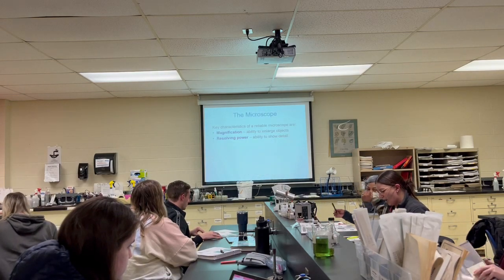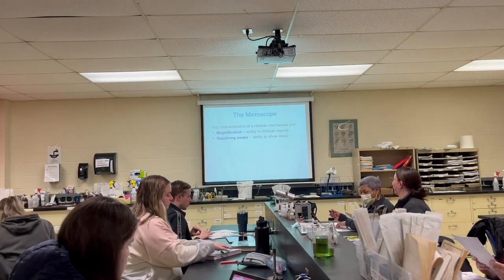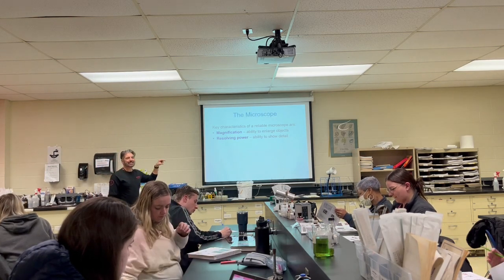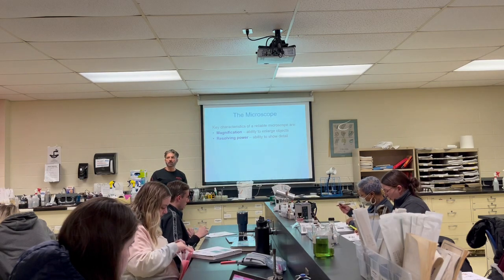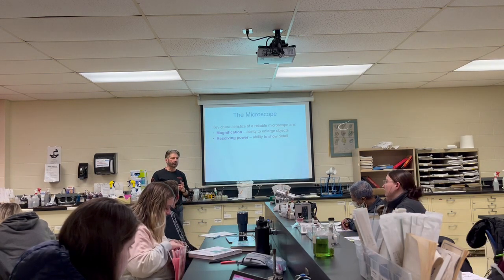All right, so I'm going to go over some just real basic things about the microscope. We'll go into a little bit more detail in lab. I'll actually pull out microscopes. We'll go over all the parts. I'm hoping you are semi-familiar with the microscope. If not, we'll review it.